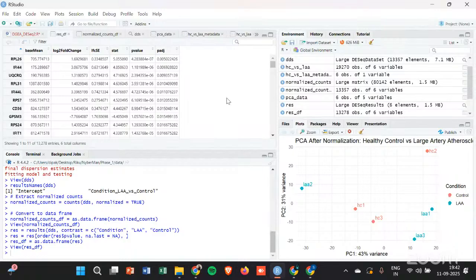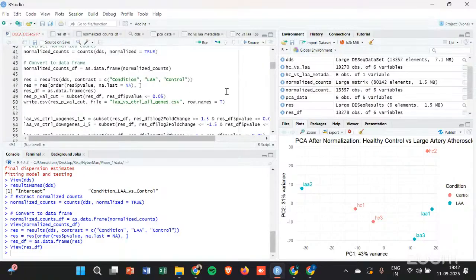This is basically a limitation of the programming language. But you can see we have barely lost maybe 60 or 70 genes. That is still fine. You don't really care about 60 or 70 genes when you think about where you started from. You started from 20,000 genes, right? So that is still fine.